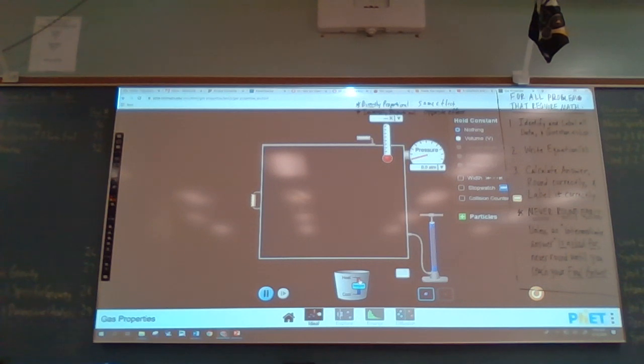First up, we are going to hold the temperature constant. Give it a few more pumps.